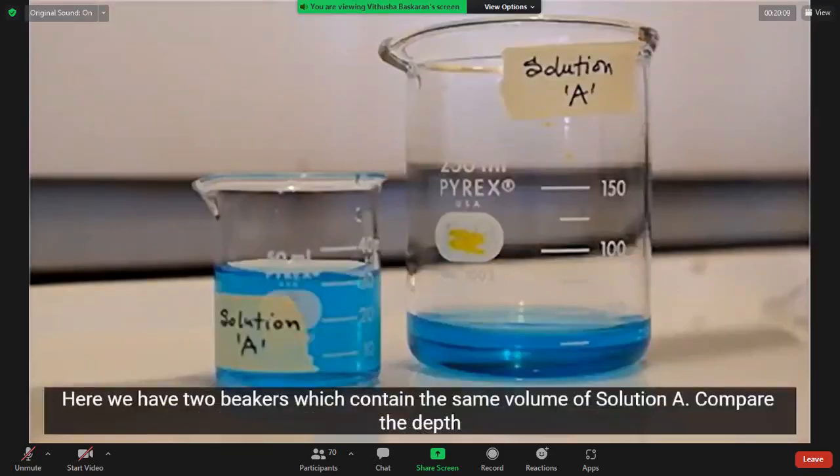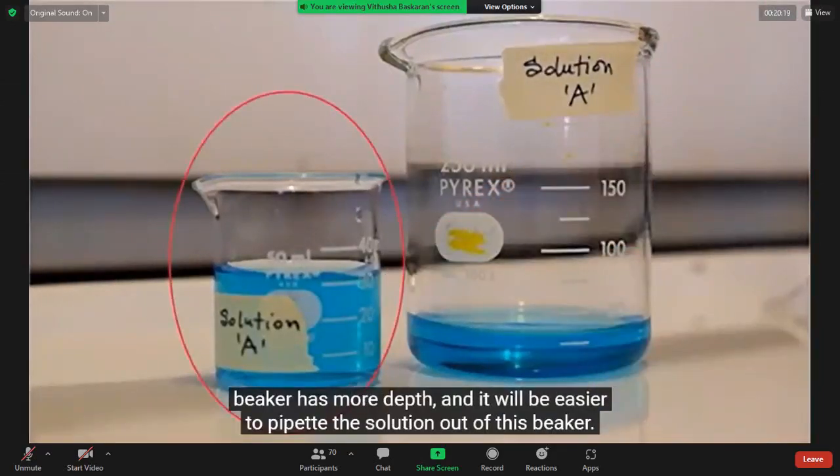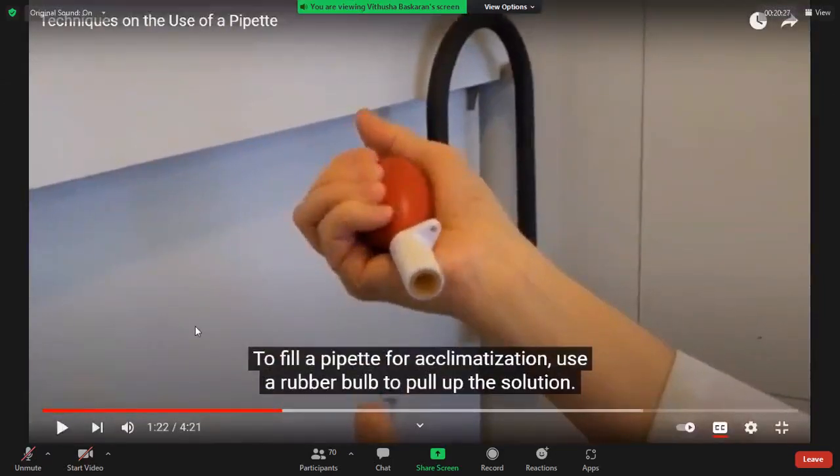Here we have two beakers which contain the same volume of solution A. Compare the depth of the solution between the 50 mL beaker and the 250 mL beaker. The solution in the 50 mL beaker has more depth, and it will be easier to pipette the solution out of this beaker. To fill a pipette for acclimatization, use a rubber bulb.